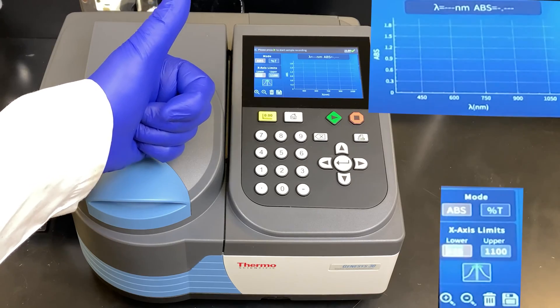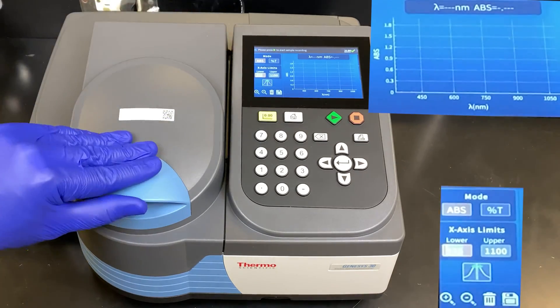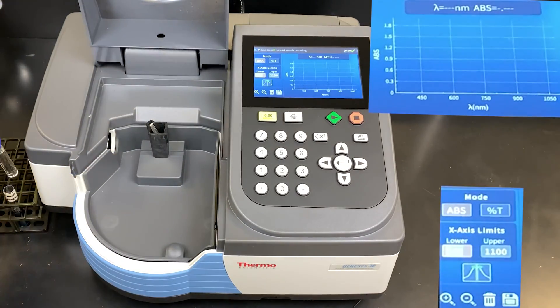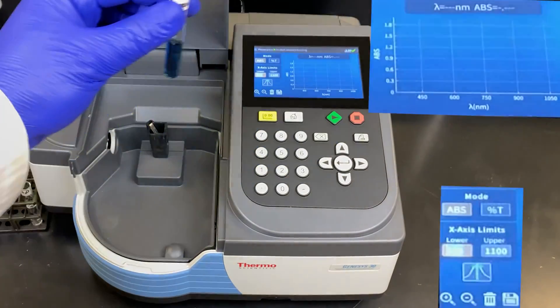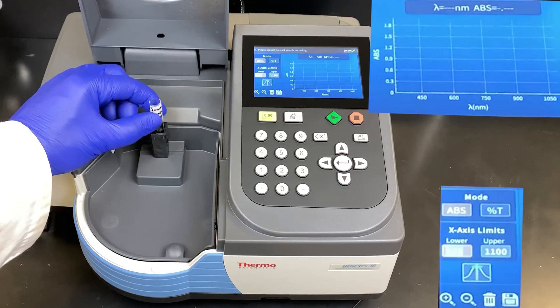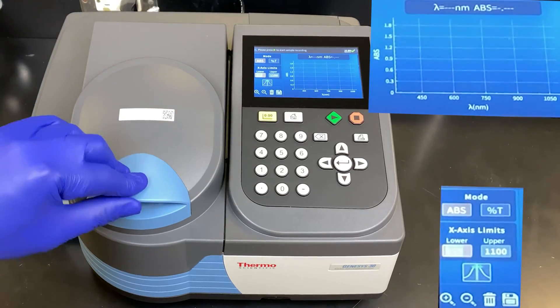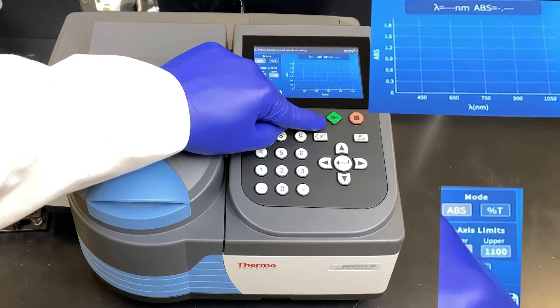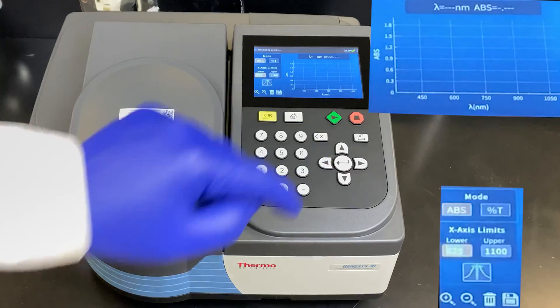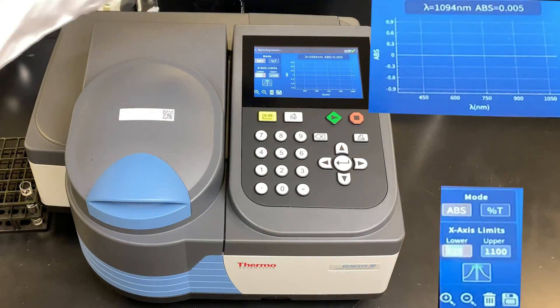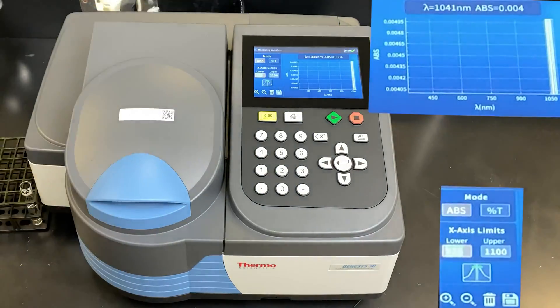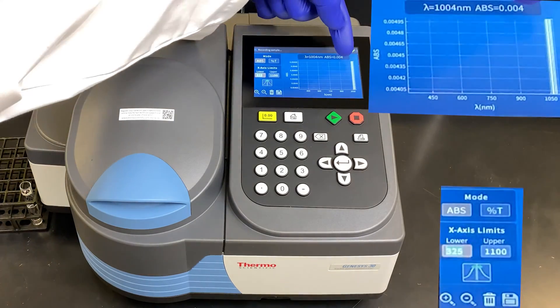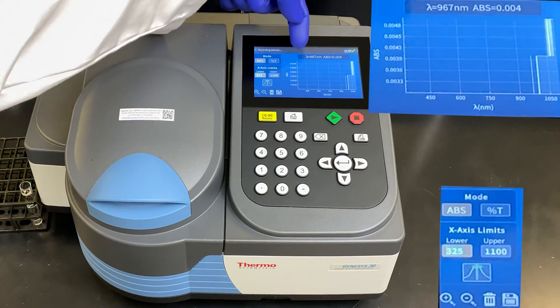Now our blank is done. It's now time to run our absorbance — you can see the mode has been set to absorbance. We're now going to take our sample of Janus Green B, making sure there's no smudges on the glass, and place it into the cuvette holder. Close the door. Press the play button to run the scan. Here we see it scanning through the wavelength, starting at our maximum limit of 1100 nanometers, reading off the absorbance as we go.